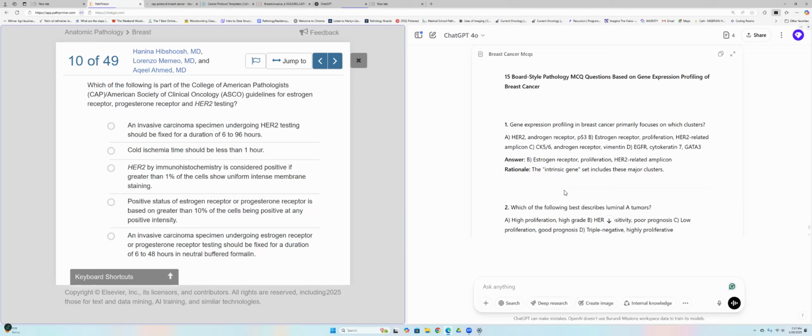To prepare the breast cancer, you ink it depending on the quadrants. If it's mastectomy, if it's lumpectomy, you ink it into 6 colors. Then after you ink it, you now bisect it and take photographs of all the bisected skin. Of course, you will take X-ray, take photographs, label where the clips are. Then you fix it in formalin. It will now be properly fixed because you have sectioned it small, and obviously it should be done in less than 1 hour.